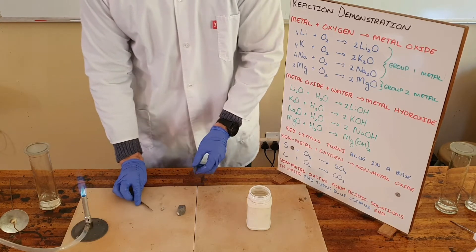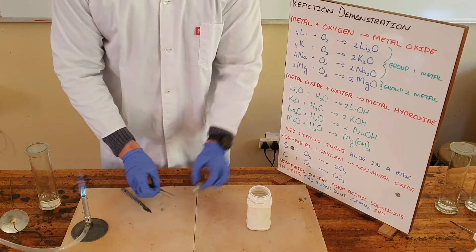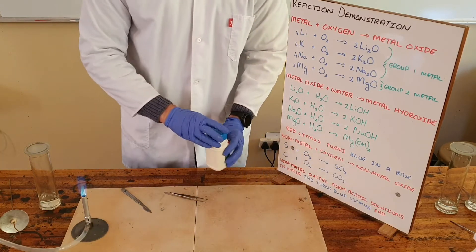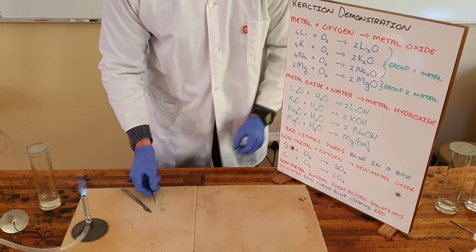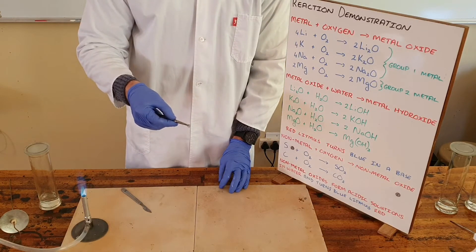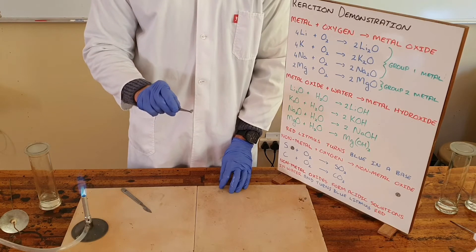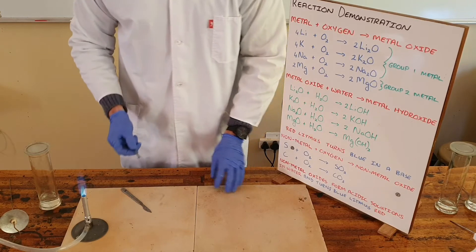It's for that reason that I'm wearing gloves as well, because there's often moisture on the skin that can react with the lithium or any group one element. You can see how reactive the lithium is by seeing that it is very shiny where I've just cut it, but the longer you leave it, the more it goes this dark color. The reason for that is that it oxidizes with oxygen that is present in the air.